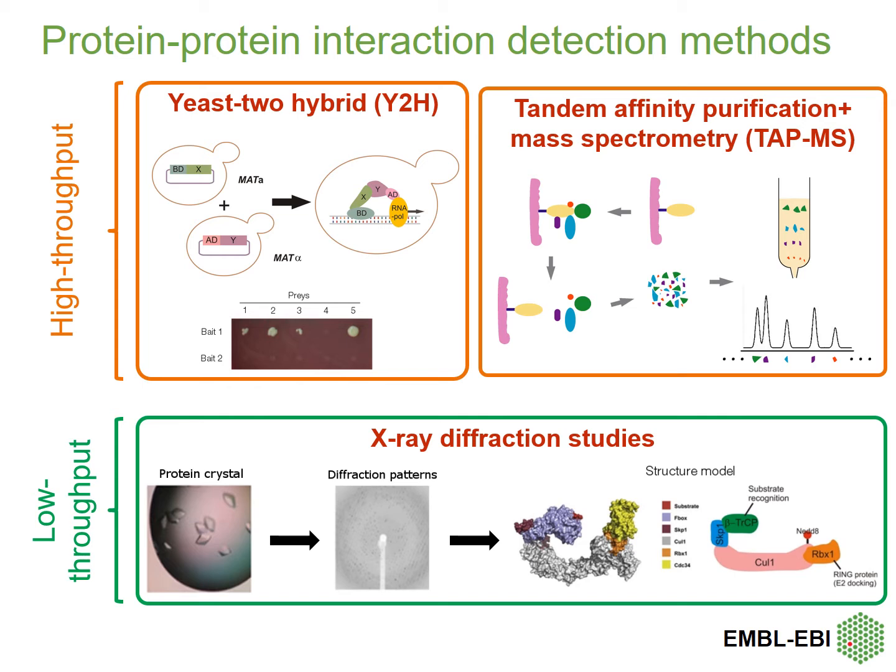How do you prove, say, this area of the CUL1, how do you prove that area is involved in binding the blue protein? Okay, you can mutate it, get rid of it, delete it, and therefore it would not bind. Therefore, the crystallization pattern would be different. You wouldn't have these things binding to it.